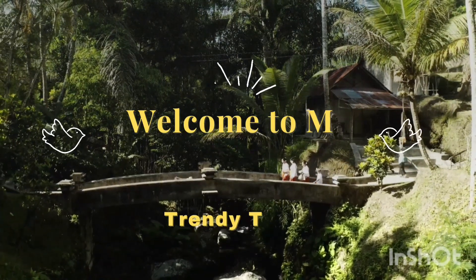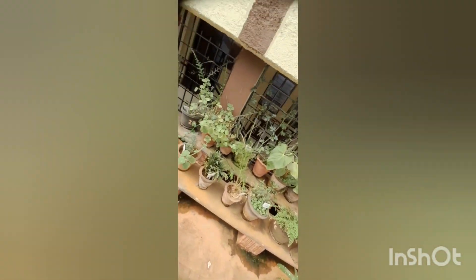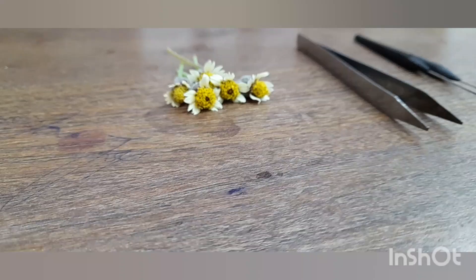Hello everyone, welcome back to my YouTube channel. In our previous video we have seen the mounting of mitosis and meiosis slides. Today in this video we'll be learning about mounting of embryo from a Tridax flower.